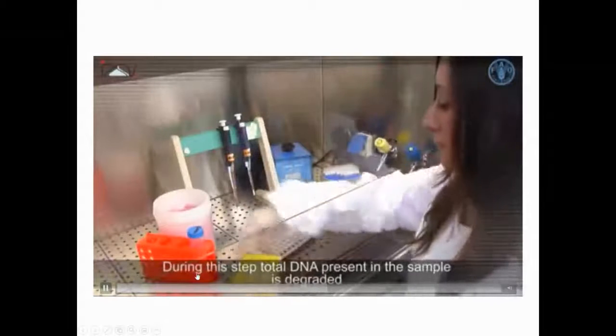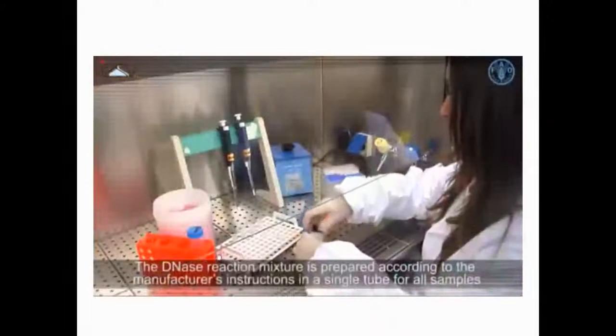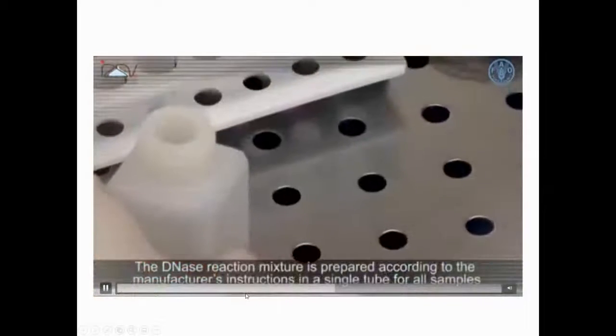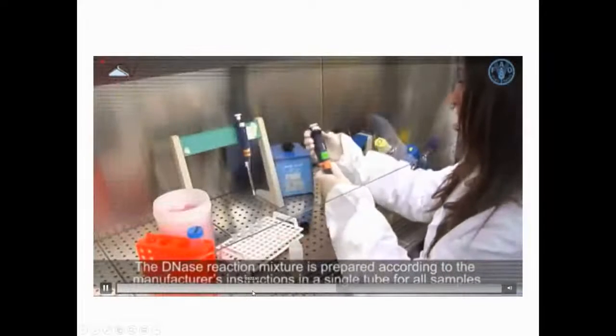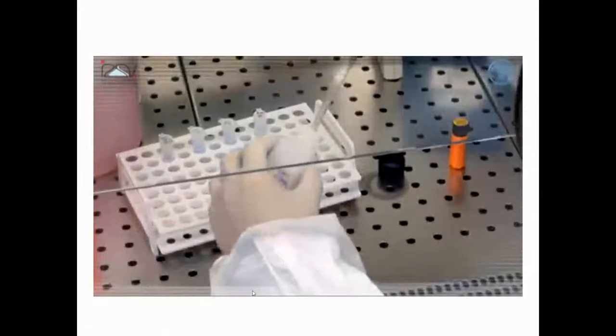During this step, total DNA present in the sample is degraded, and only the total RNA of the sample remains on the filter. The DNase reaction mixture is prepared according to the manufacturer's instructions in a single tube for all samples, and then dispensed into each single column.